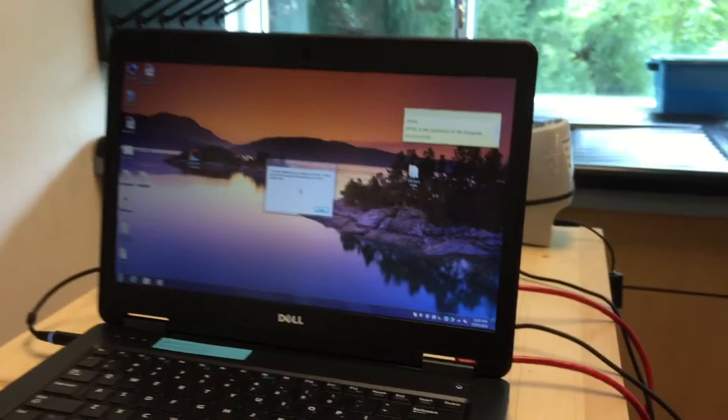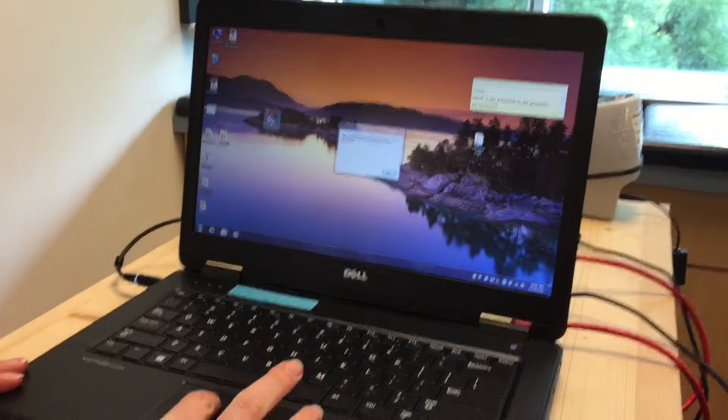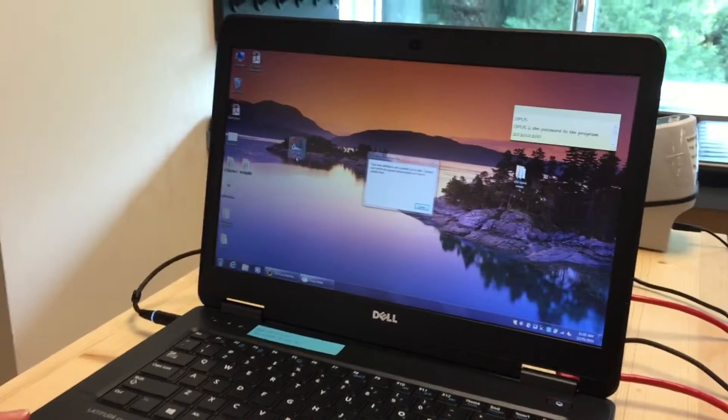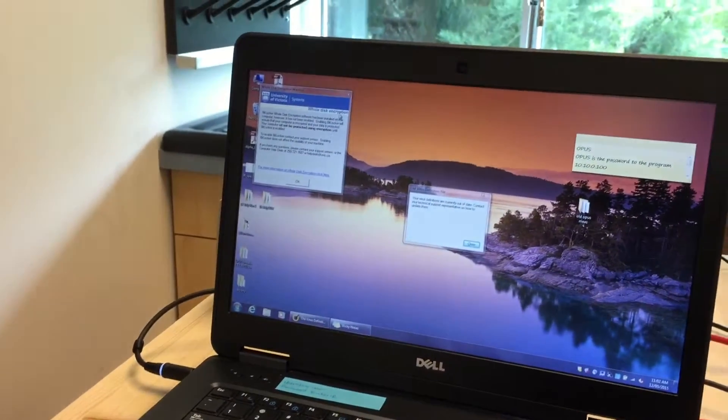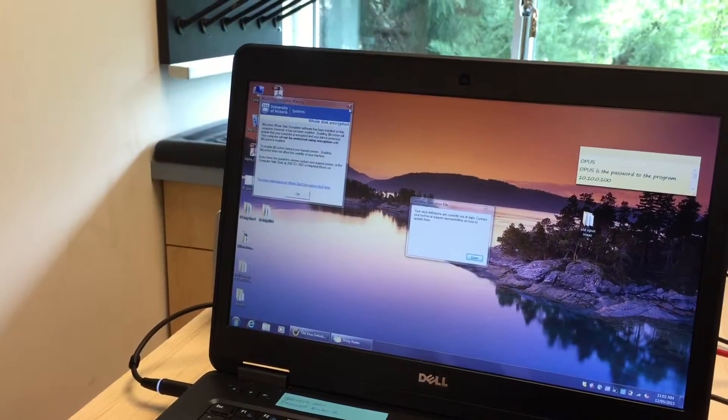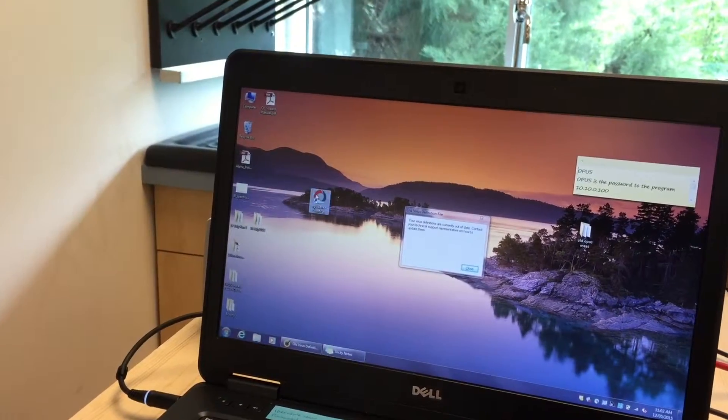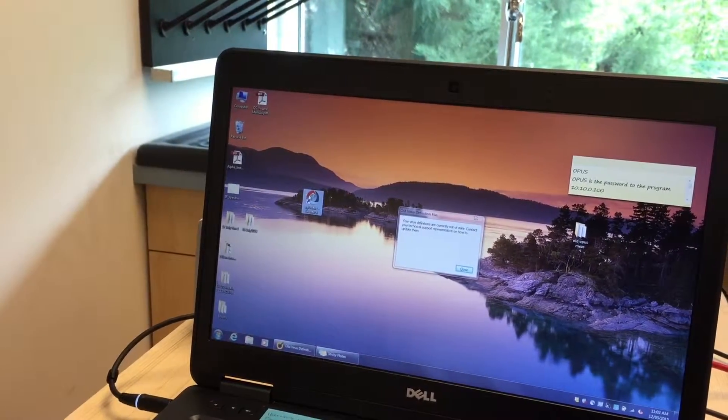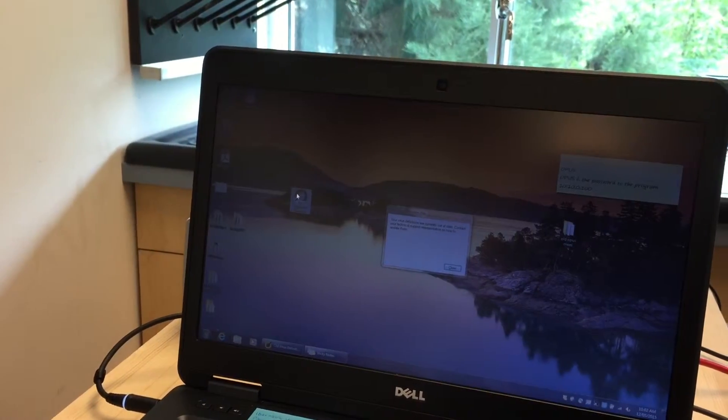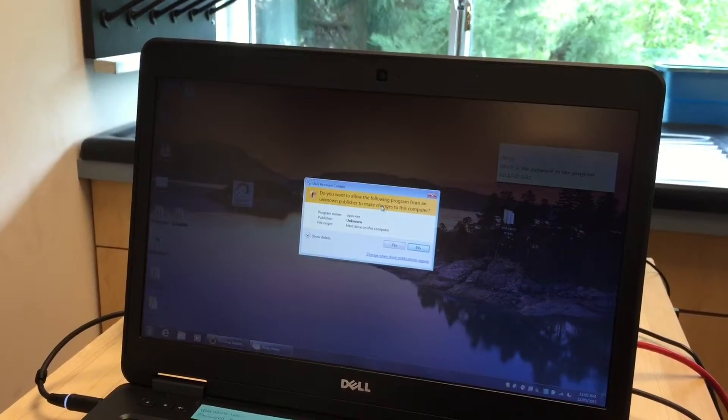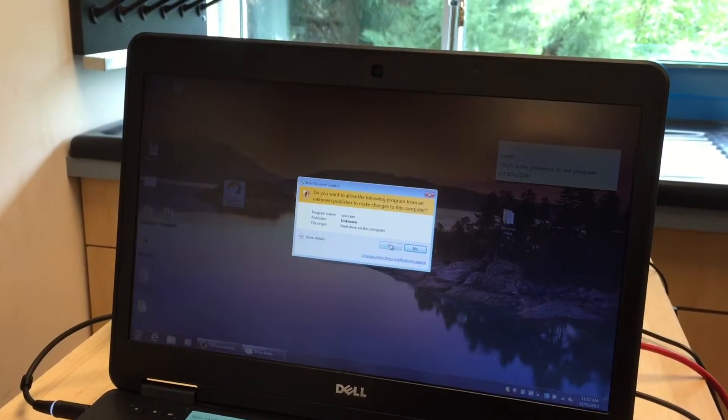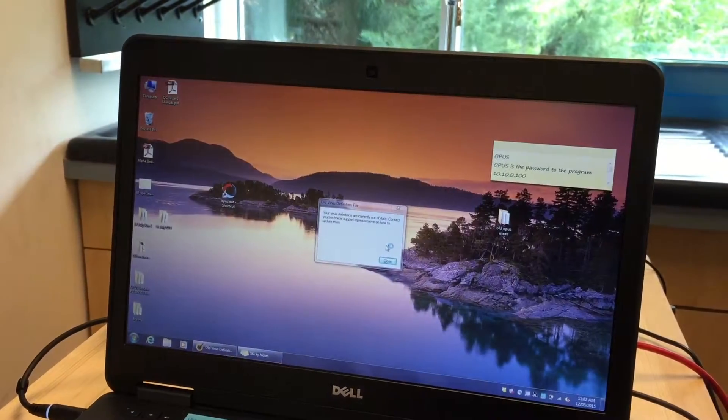Okay, so the program we're going to use is called Opus. It's right here. Let's exit out of this first. You're going to open the Opus program. Yes, we do want to make changes.